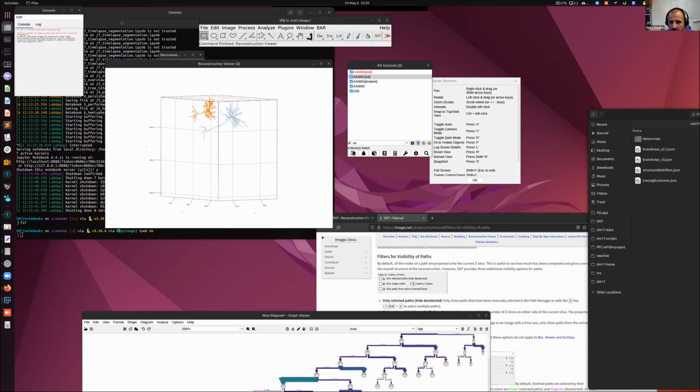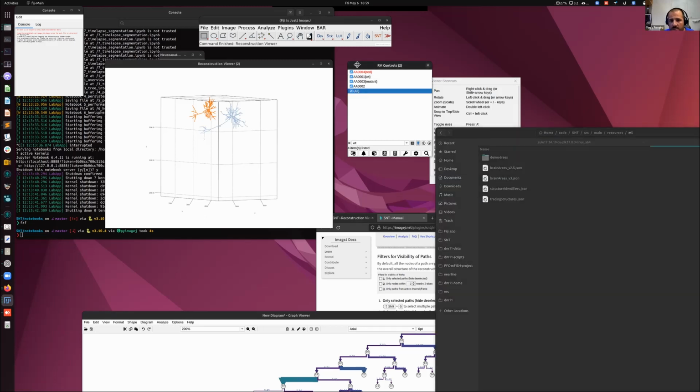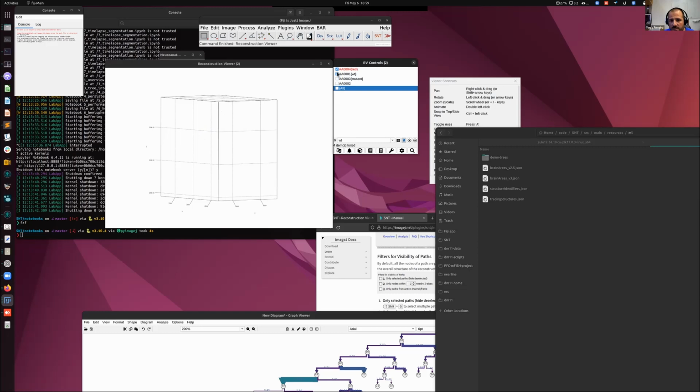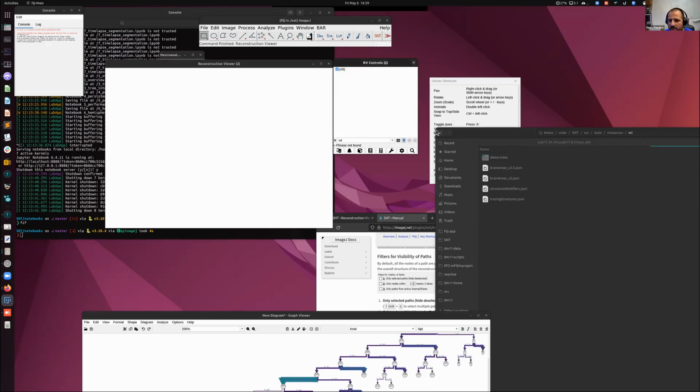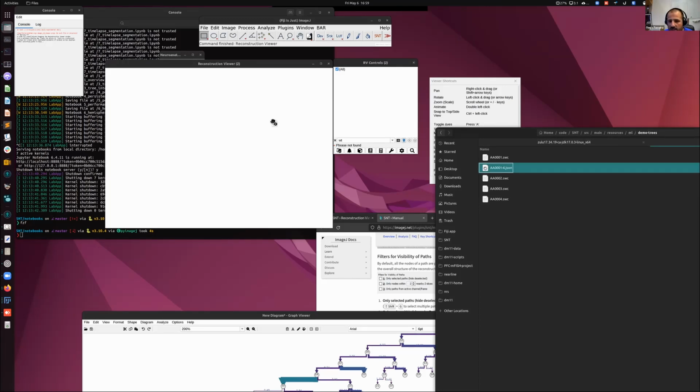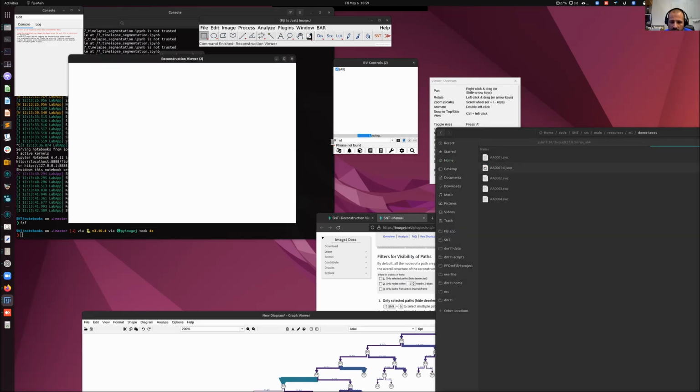So I'm going to delete these neurons. Now you have controls to toggle their visibility. In this case, all. So I can just delete everything. So I'm just going to remove selected because I'm selecting all. I'm going to delete everything, and I can just drag and drop things into here, and they should load. In this case, I'm loading a JSON file from our database. That may not be the right version of the JSON file, actually.